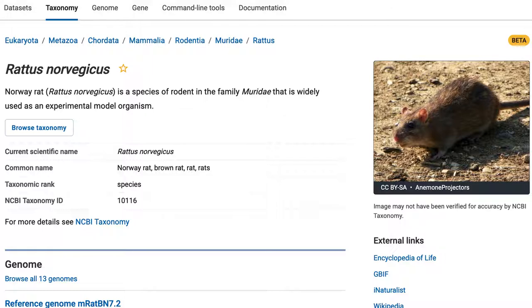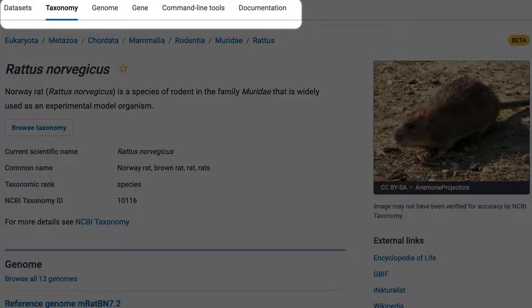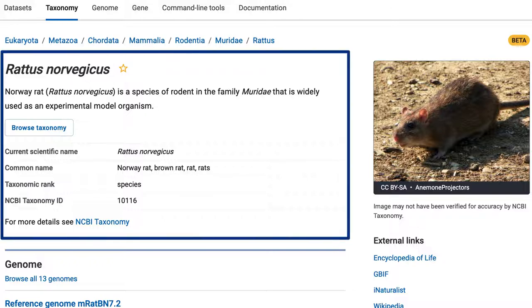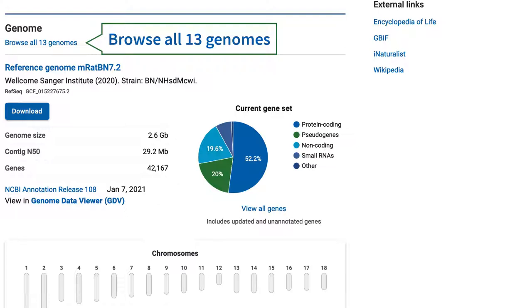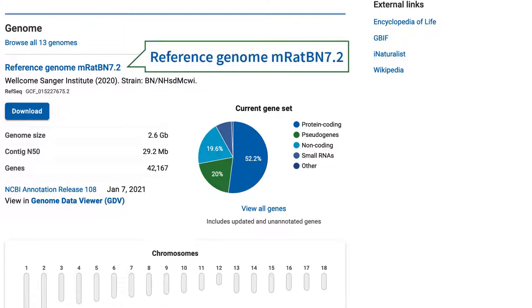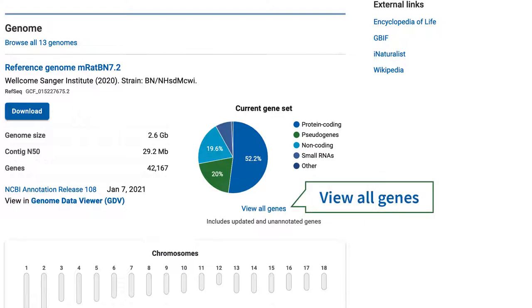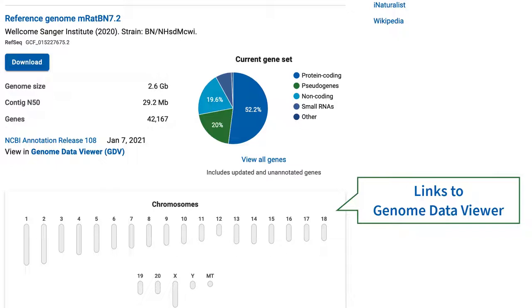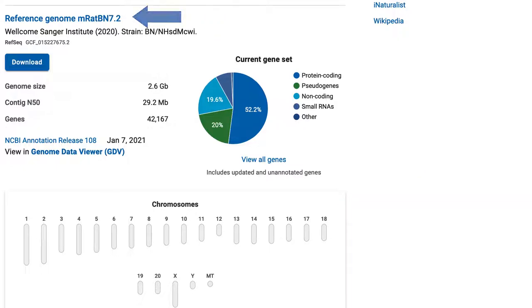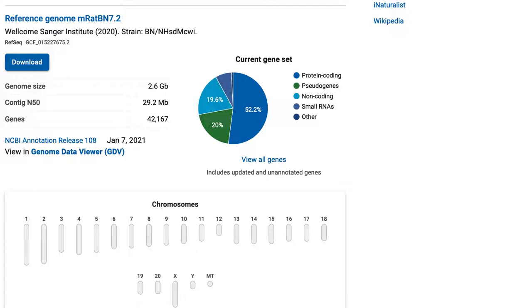A new feature is the navigation across the top of the page. On this page, you'll find basic taxonomic information, a quick link to all genomes for the species, a link to the reference genome, a link to the reference gene set, and chromosome images which link to GDV, the Genome Data Viewer, for the reference genome noted above. To download files for the reference genome, click the blue Download button. Keep in mind that this taxonomy page is a work in progress and will eventually serve as the portal into all data for the species.